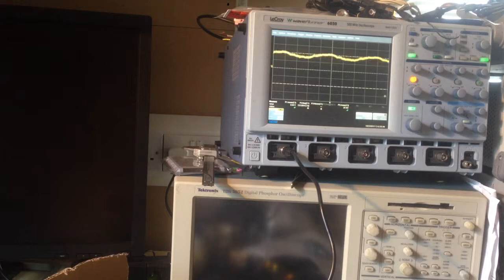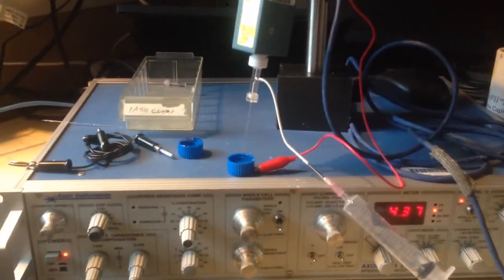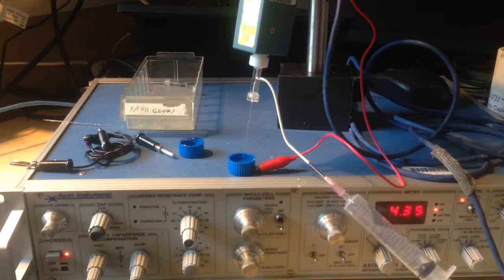I still can't characterize the tip size from that. It's way too messy an experiment. But fundamentally, I think I have a little bit of confidence that this rig can work, and I have an aperture at least in the capillary, which was something I was also worried about. I was worried there was something wrong with the puller, and the pipette tip was completely occluded, or something like that. So it does seem like there's an aperture there. So that's just a first go.